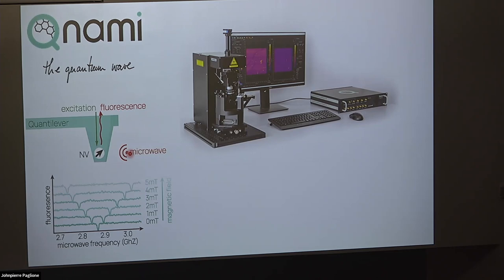Because in the DynaCool, we don't worry about vibrations. We often get asked about vibrations in the DynaCool, because some people want to do optics-like experiments. We even sell an optical multifunction probe for the DynaCool, a little positioner stack, but it's just for very coarse positioning. That's vibrating a lot. And everything's suspended on a sample chamber that's a meter long, that's primarily connected at the top. So it's just the opposite of the skyscraper problem, where it's moving a lot at the top.